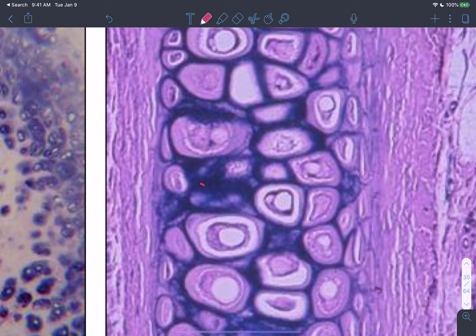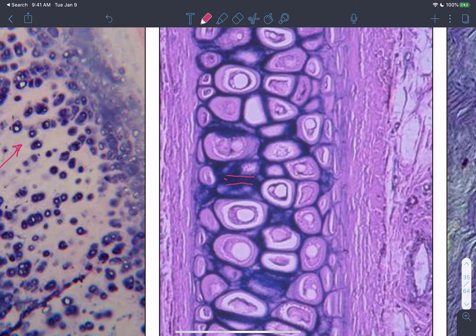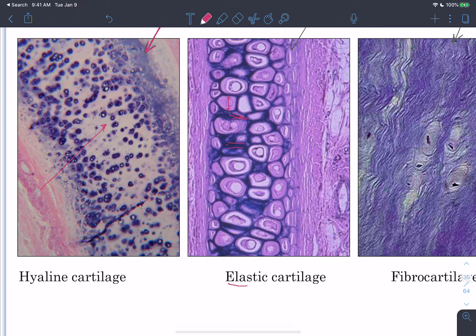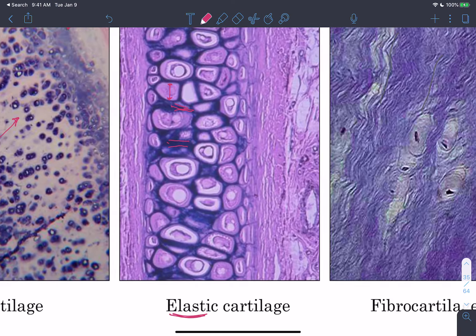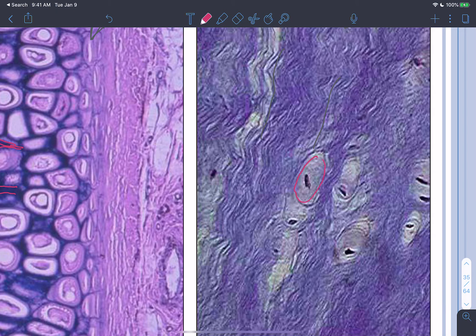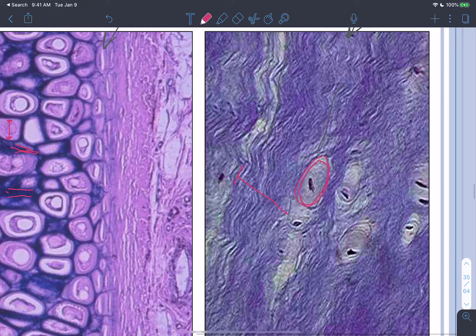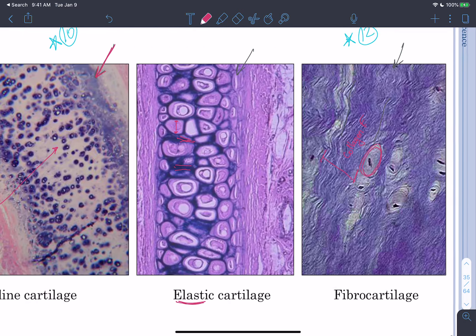Elastic cartilage shows fibers between the chondrocytes in lacunae; comparing fiber diameter to chondrocyte diameter reveals a much smaller diameter, confirming elastic fibers — therefore elastic cartilage. Fibrocartilage shows chondrocytes in lacunae with thick bundles of collagen fibers traveling through the matrix — extra collagen fibers within a cartilage means fibrocartilage.